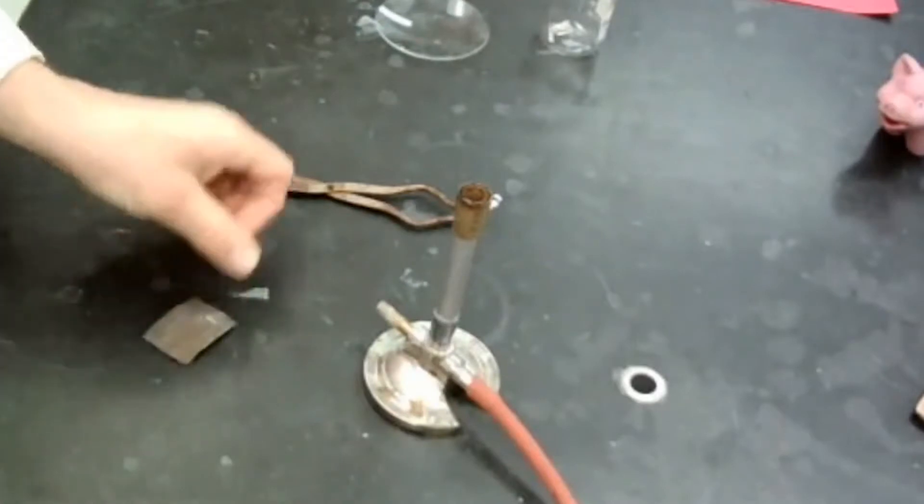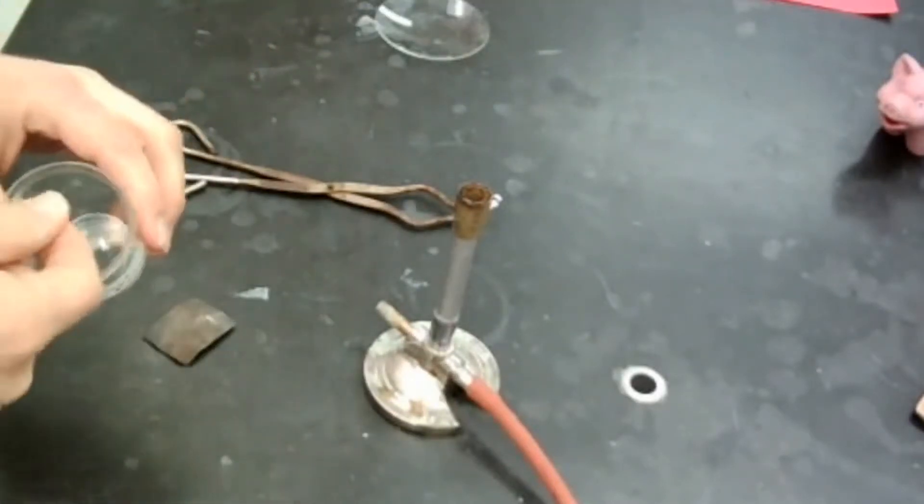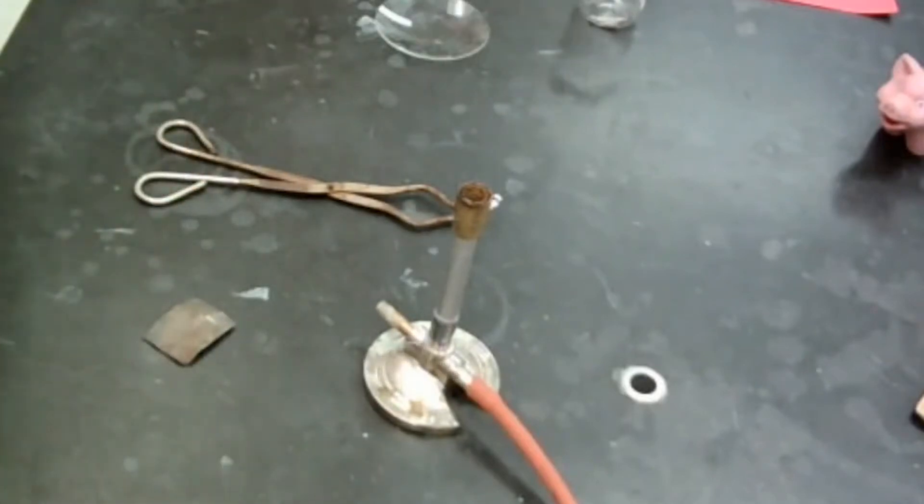Alright, so without further ado, we'll get started. First part of this is making observations, and so I'm going to grab a piece of magnesium ribbon. So let's look at what our reactants would be. These are the things that go into the reaction.